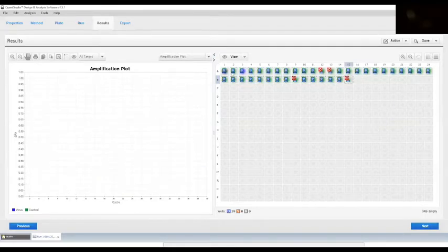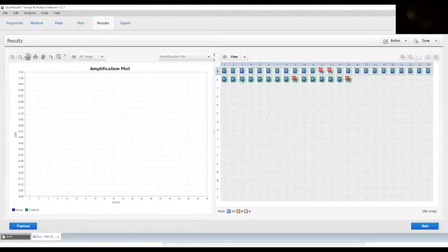Once you have omitted all your samples that can result in such spikes, you reanalyze everything.